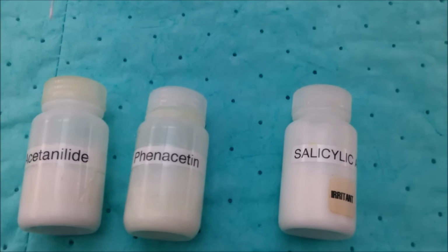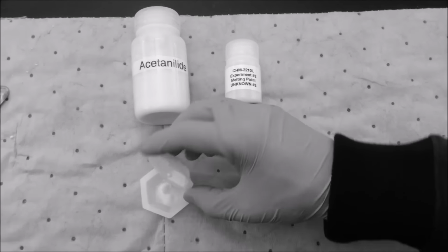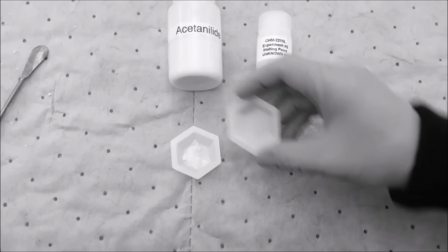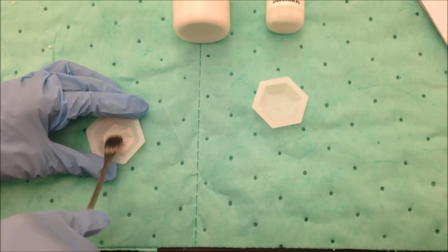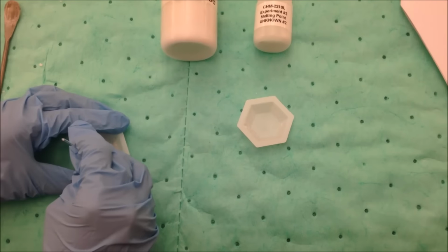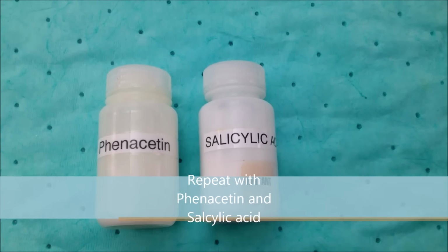Obtain an unknown. Take a small amount, 0.1 to 0.2 grams of your unknown mix, and mix it with the same amount of acetanilide. Pulverize the sample by crushing it with a metal spatula and place it into a capillary tube. Repeat steps B and C with phenacetin and salicylic acid.